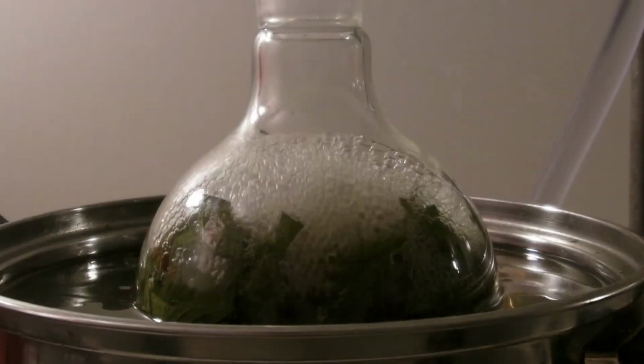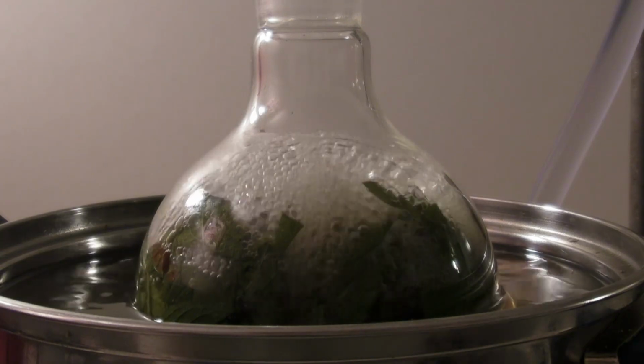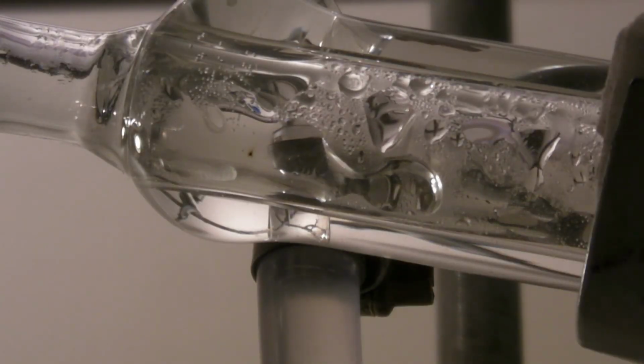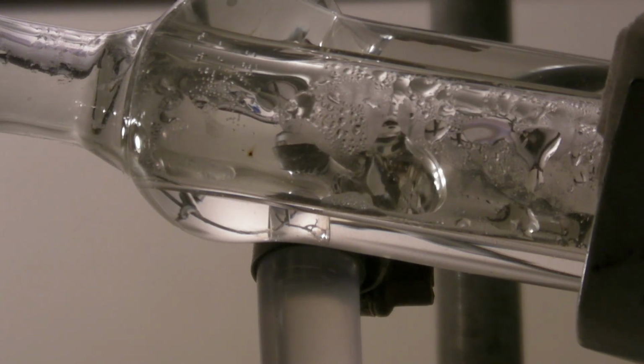At the beginning of the distillation it can be observed easily that a mixture of water and oil is condensing in the cooler. In the receiving flask both phases are collected. The steam is able to carry the oil or other steam volatile compounds into the condenser, so these can be distilled off too. The steam only has a temperature of 100 degrees C, so sensitive compounds which have a way higher boiling point can be distilled gently. An example is menthol, which is the main part of the peppermint oil and boils at 212 degrees C.